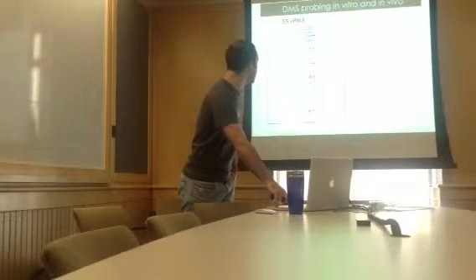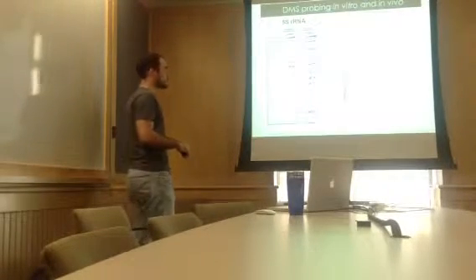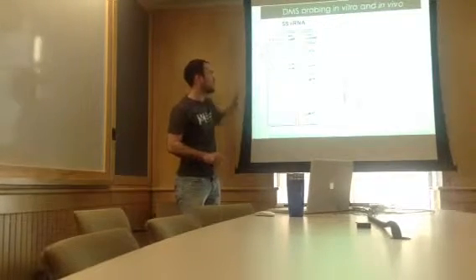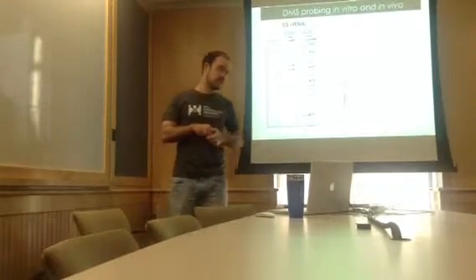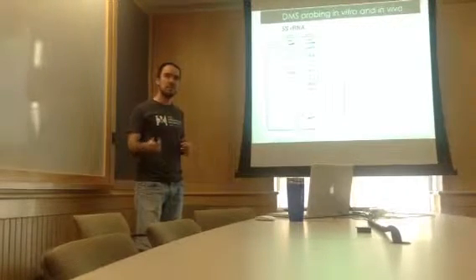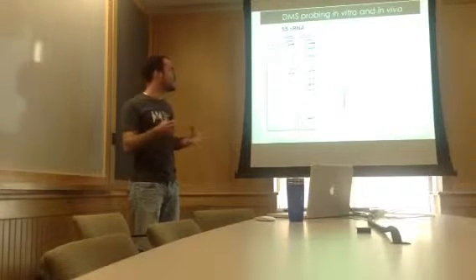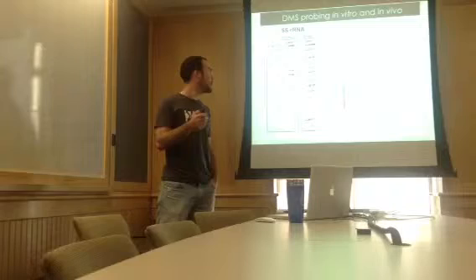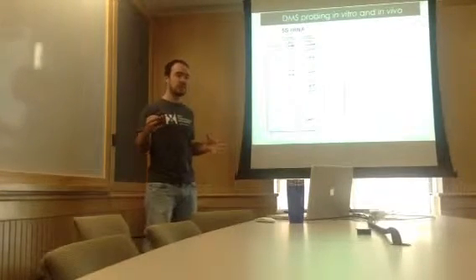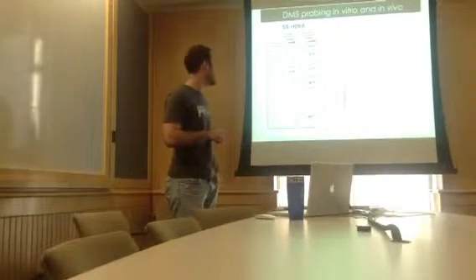And more interestingly, when we look at the in vivo probing of the DMS, we can see that a lot of bands disappear. Actually, almost all of them, which makes sense because, as you know, a 5S ribosomal RNA in vivo is in a complex called a ribosome and interacts with a lot of ribosomal RNA and ribosomal proteins. So it's normal that most of its groups become less accessible to probing by DMS.